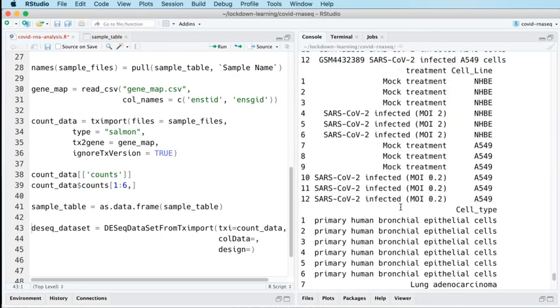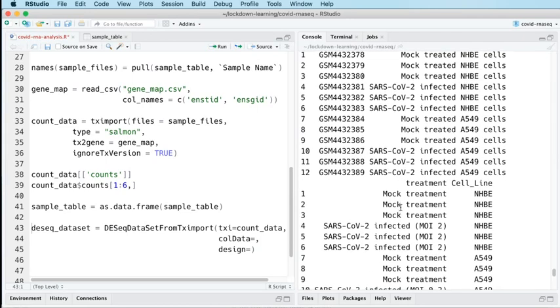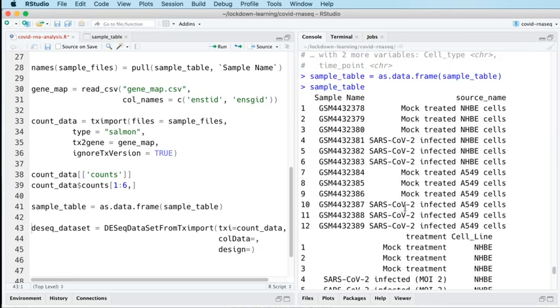Okay, so that's one thing. The other thing that I want to do, there's two more things, sorry, the two things that I want to do. I want to change this sample name so it's not got space in.